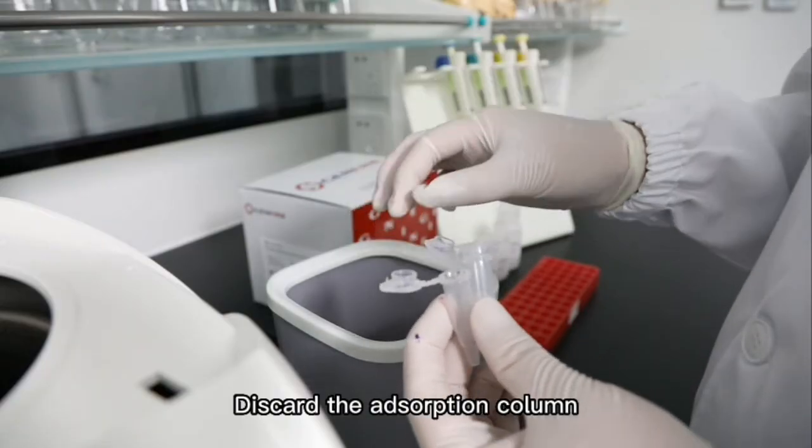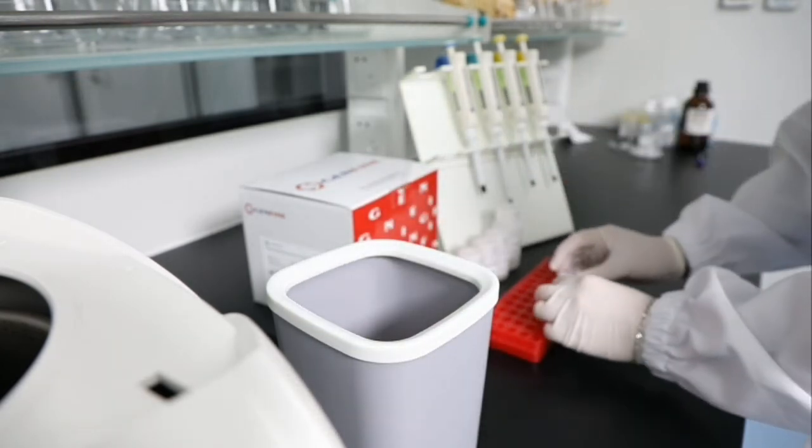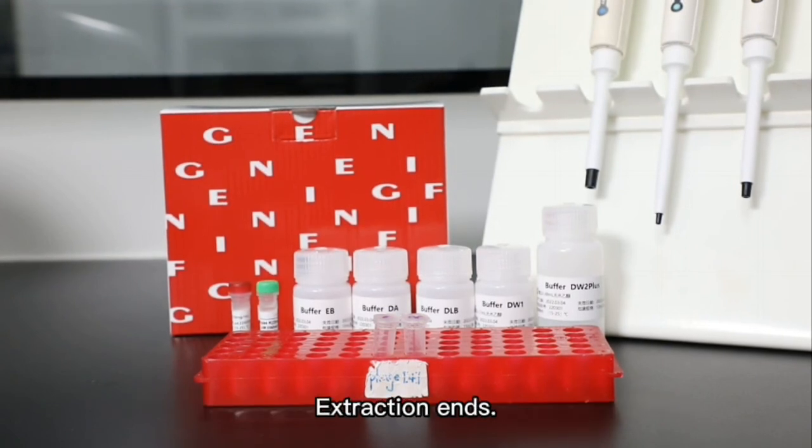Discard the adsorption column, and collect the DNA solution in the centrifuge tube. Extraction ends.